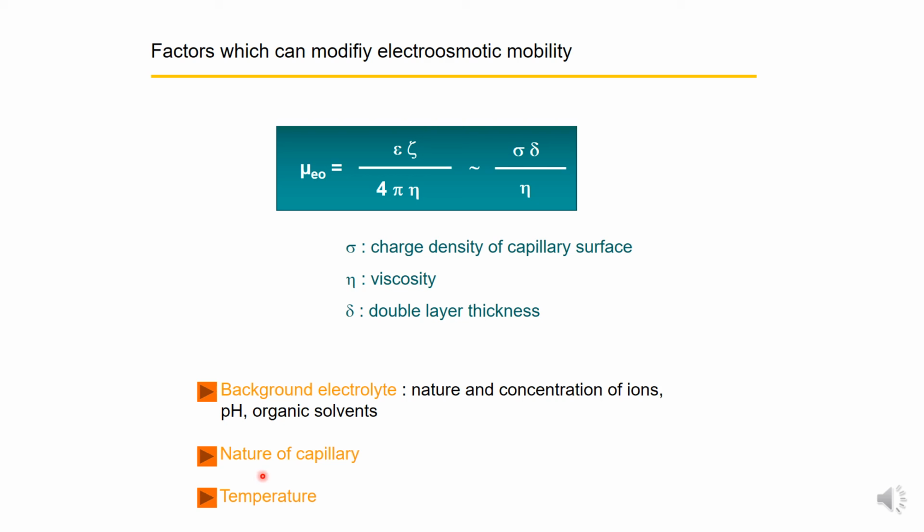We have seen that the nature of the capillary is important. We can work with a bare-fused silica capillary, but also with a coated capillary, and then in a reverse mode or in a neutral mode. And of course, we have to be careful about the temperature because we work with viscosity. An increase of temperature gives a decrease of viscosity.